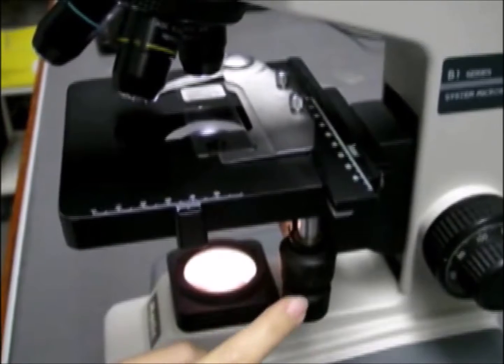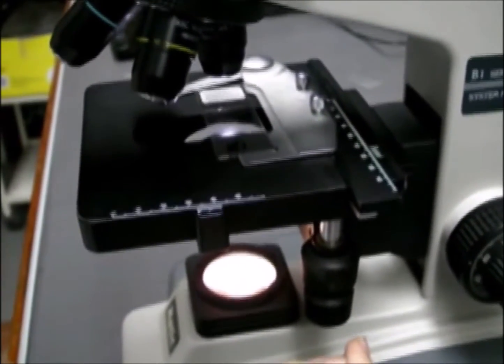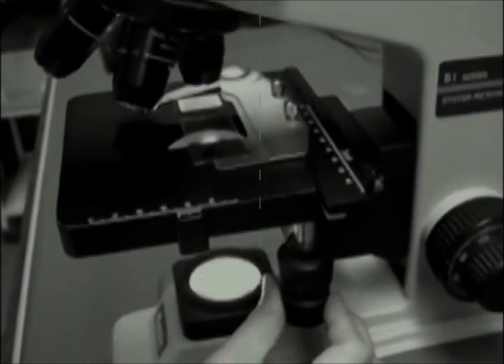There are two adjustment knobs on the right below the stage. One knob moves the slide front and back, while the other knob moves the slide left and right.